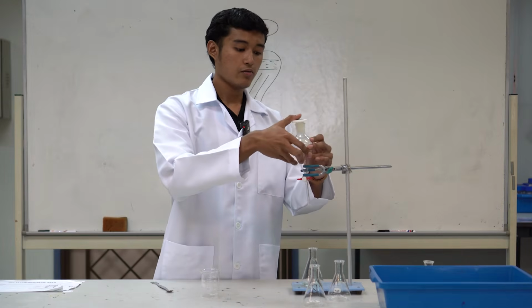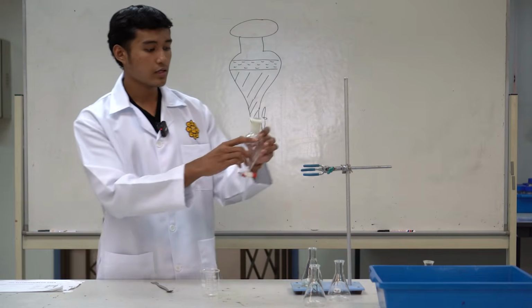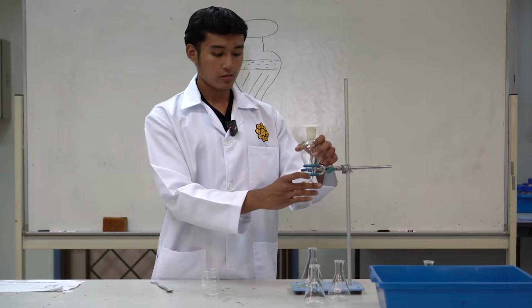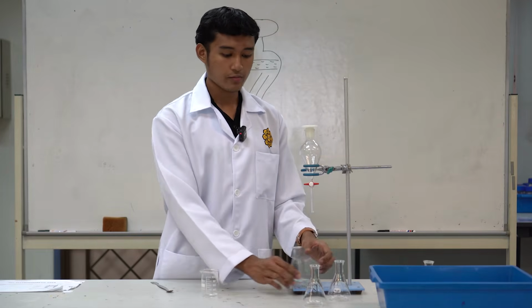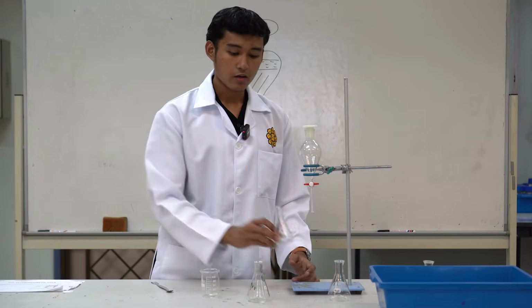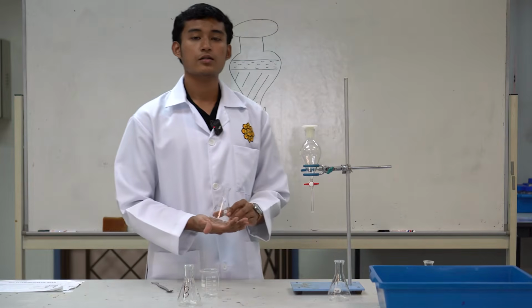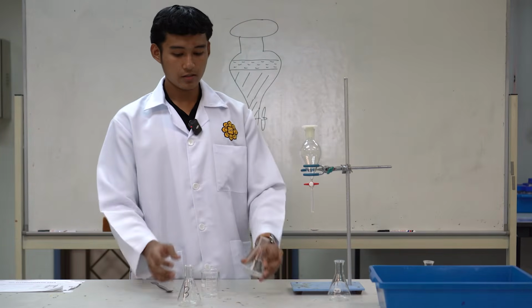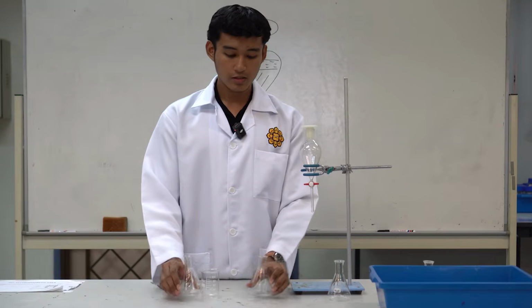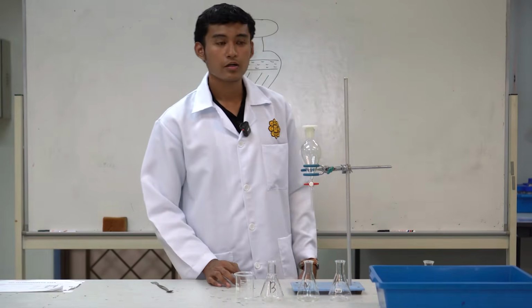We'll take it out and shake it vigorously, the second time we're doing it. So now we have the mixture, we will extract it out, and we have the pure base, or aqueous base. The mixture now is basically the neutral part, the neutral solution. So that's it, and our extraction is fully complete. Now I will pass the floor to Brother Idlal.